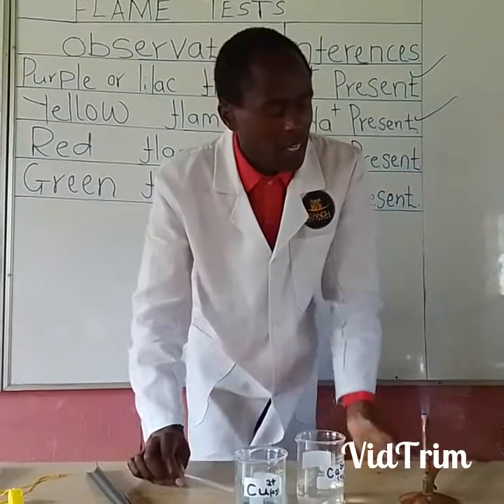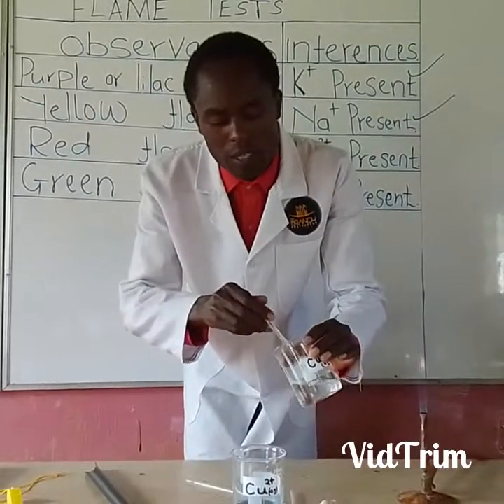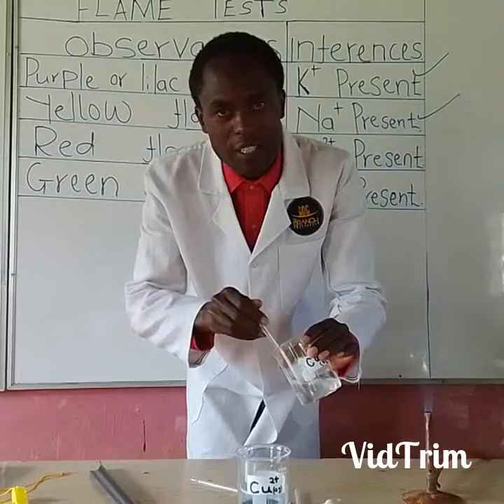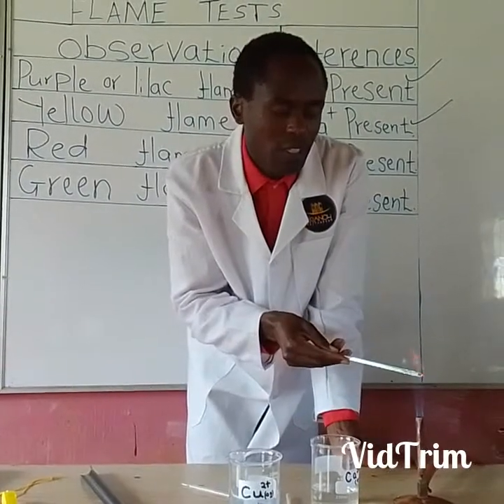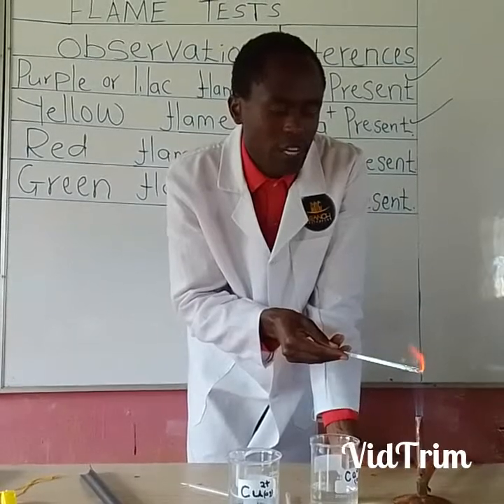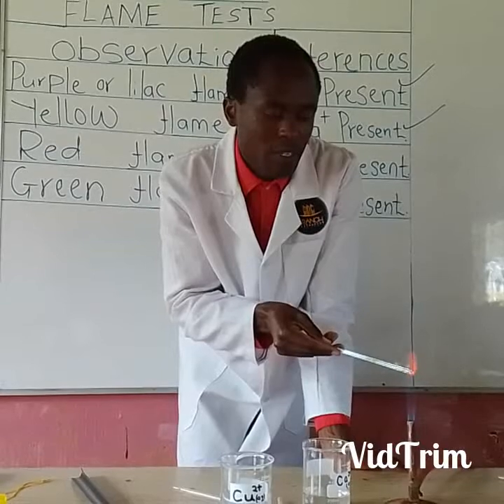calcium ions. I can even repeat the same calcium ion, then continue making observation. Are you seeing the red flame? Yes, you see a red flame.